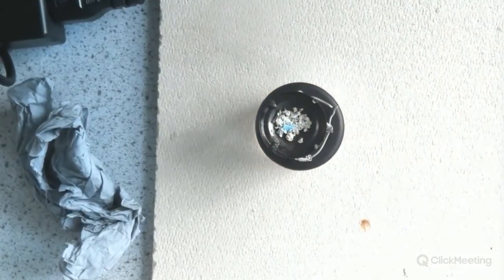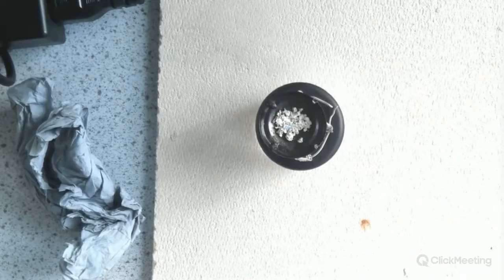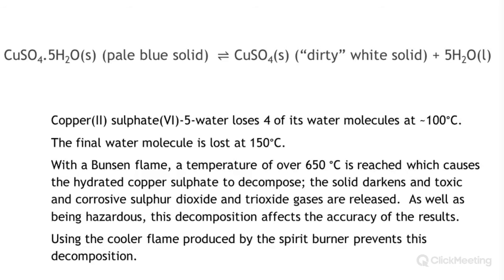At the end of this experiment, they would weigh the bottle top and do some mole calculations to figure out the number of moles of water lost and therefore attached. Generally, most times I get round about 5. If it's been less than 5, it's probably because I'm using copper sulfate that hasn't been fully hydrated. Now, there are additional advantages of using a spirit burner for this experiment. It works fine without a desiccator, and you don't need crucibles.